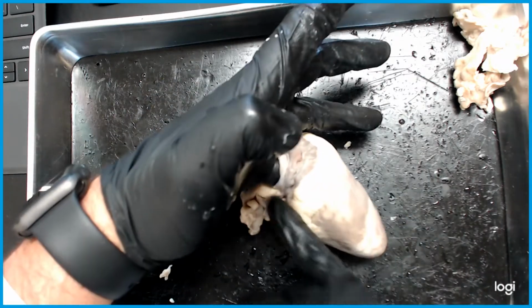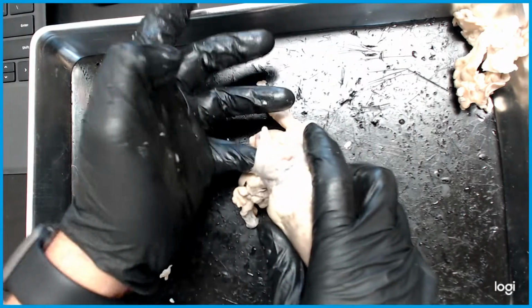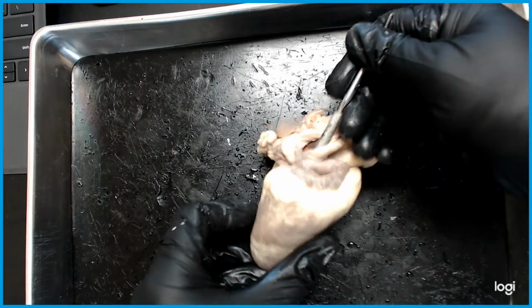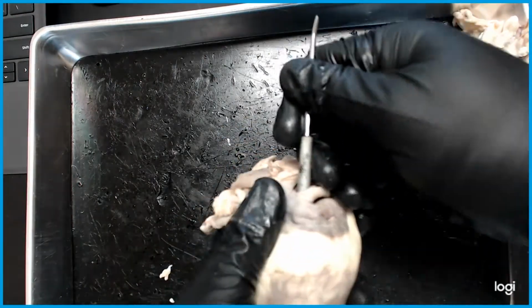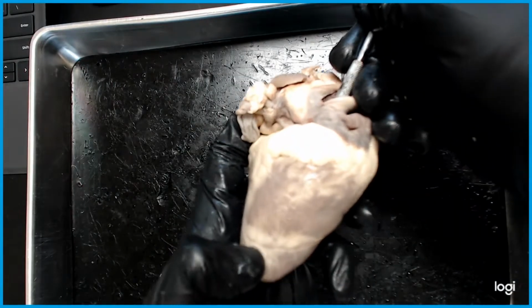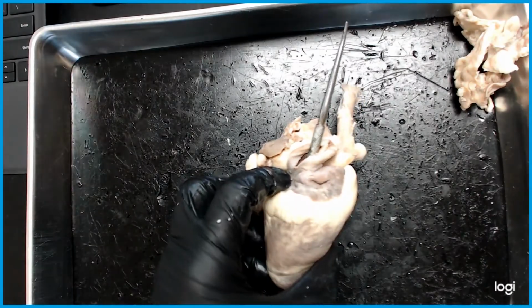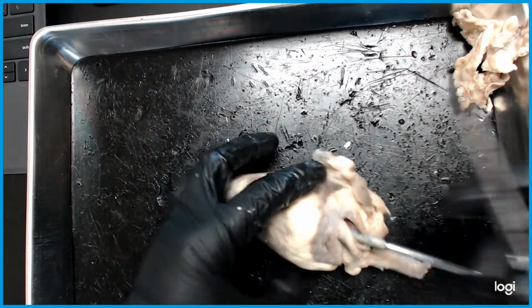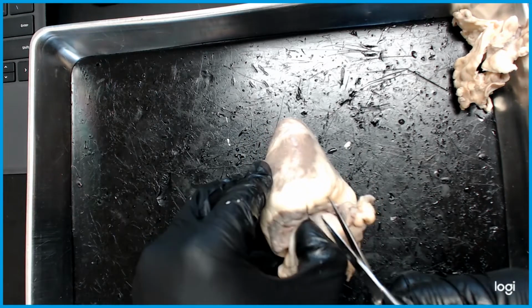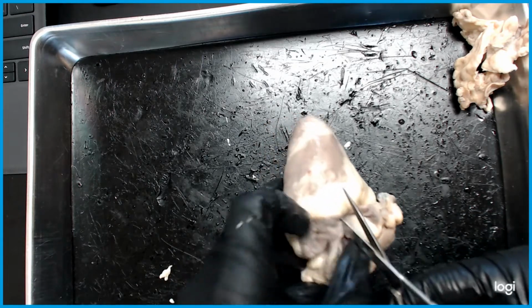That's going to allow me to see the full ventricle, and I can follow through where the blood flow goes. So what I'm going to do is place a probe in here so it reaches to the bottom of the heart. It's closer to the apex. That tells me that I've reached the bottom portion of the ventricle. Now that my probe is in place, I'm going to position this for cutting comfort, and I will follow through. Your probe is your guide to make sure you're not going anywhere you're not supposed to.